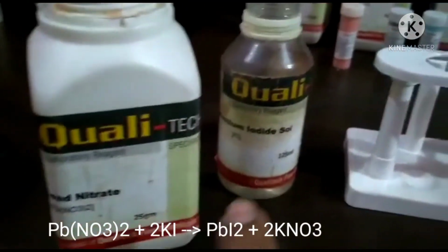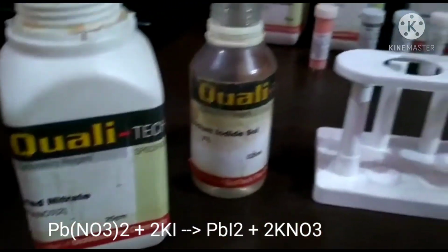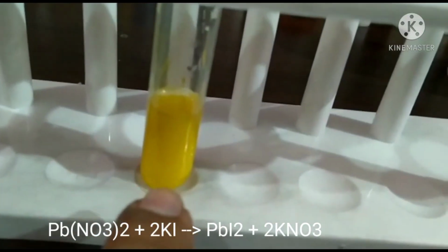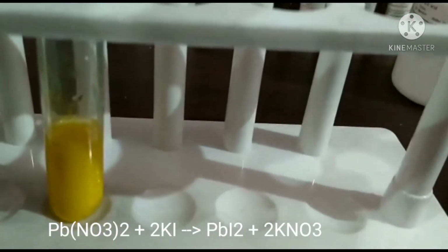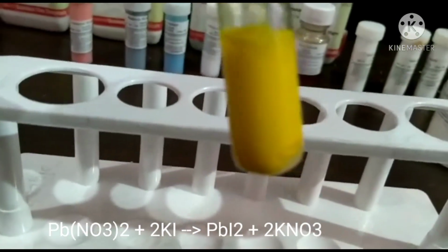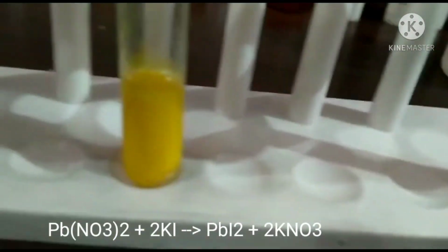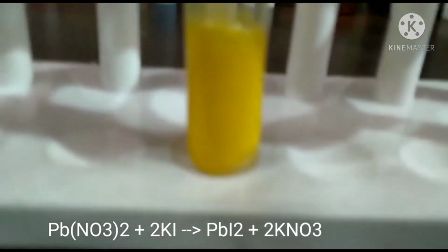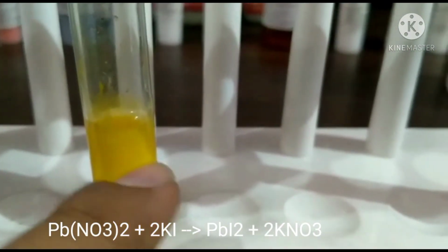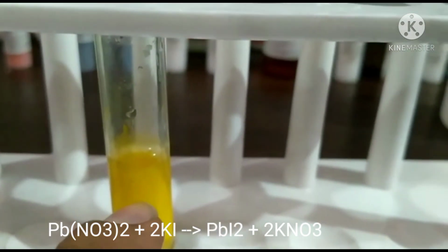Lead nitrate and potassium iodide react, and they give lead iodide and potassium nitrate. The yellow color compound formed here is lead iodide. The compound formed below is yellow lead iodide, which is a precipitate, and the solution above is potassium nitrate.